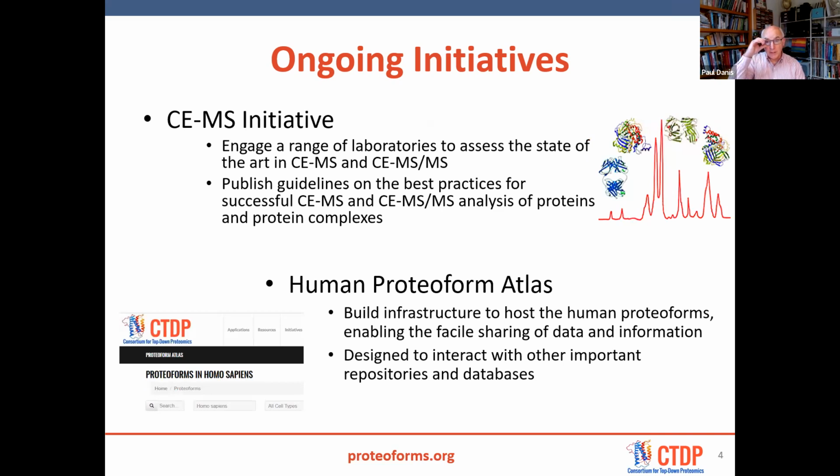We have a CEMS initiative. Again, CEMS has great potential, and there's been some awesome publications around some of the protein separation work. But again, there's challenges for people who are trying to attempt this work. So Liang Sun, Alexander Ivanov, and Kevin Jost are leading this work where they're assessing the state of the art through a variety of laboratories, doing some standard work to cover a lot of the different platforms that are out there, to try to establish some guidelines around how you go ahead and move forward with this.